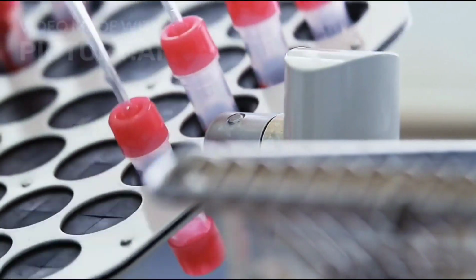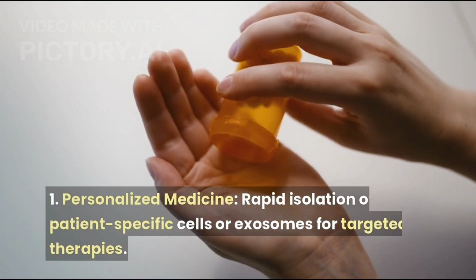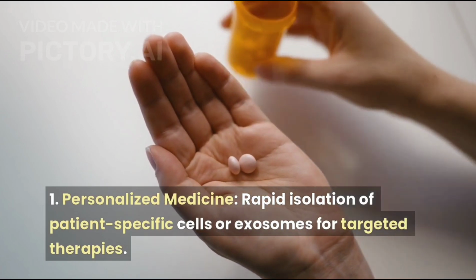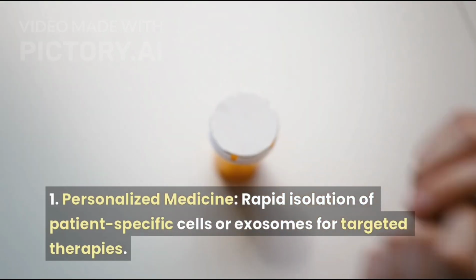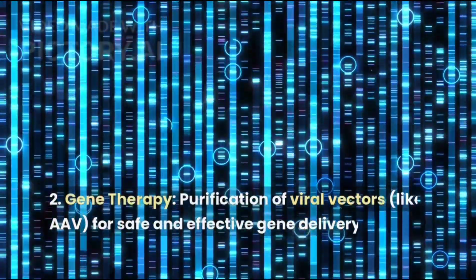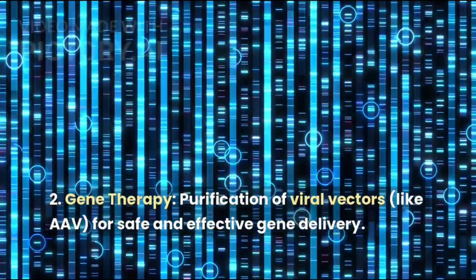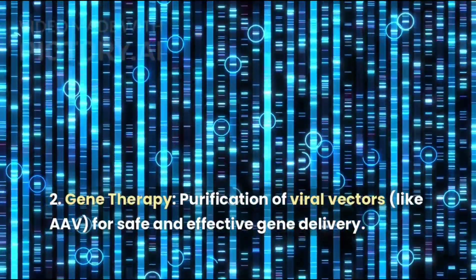Future applications in biology and medicine. Number 1, personalized medicine, rapid isolation of patient-specific cells or exosomes for targeted therapies. Number 2, gene therapy, purification of viral vectors like AAV for safe and effective gene delivery.